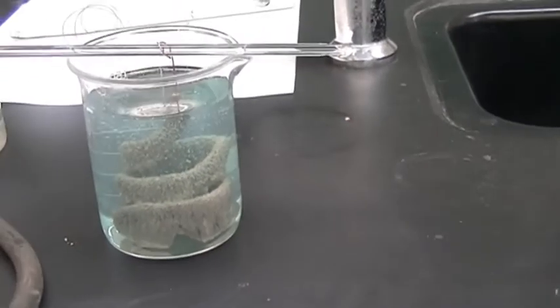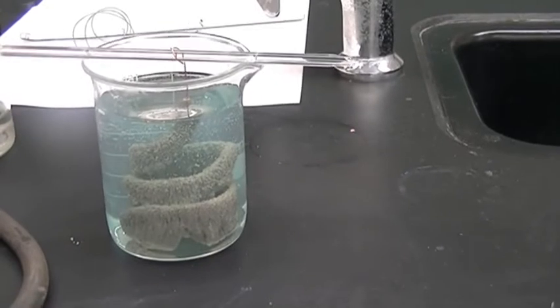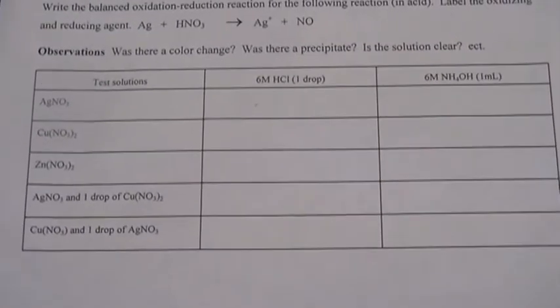Alright, so now we're going to do some qualitative tests. In our spot plates, you have your report sheet, and I'm just following the report sheet.